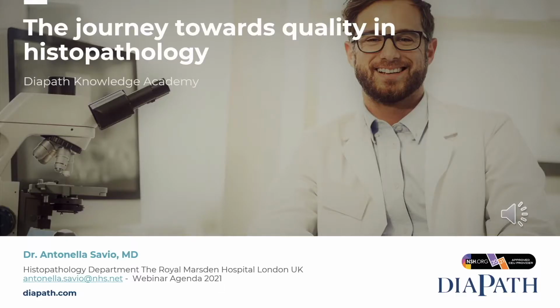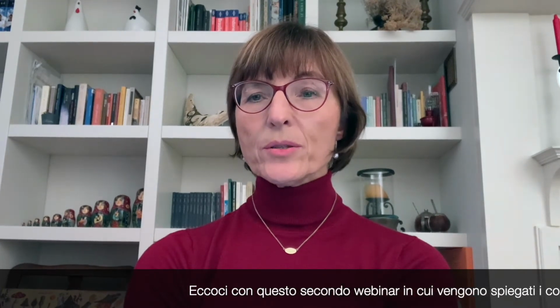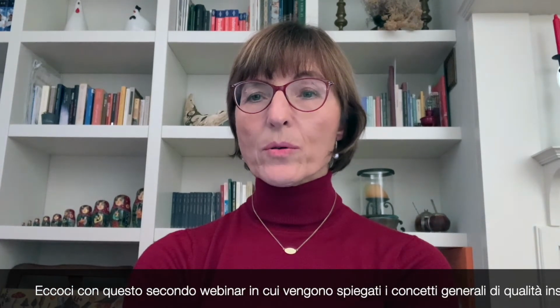Now, let's start with the webinar. The Journey Towards Quality in Histopathology. Here we are with this second webinar, The Journey Towards Quality in Histopathology. Today, the general concepts on quality in histopathology departments are explained together with the strategies to pursue continuous quality improvement. Special attention will be given to specimens reception and traceability.